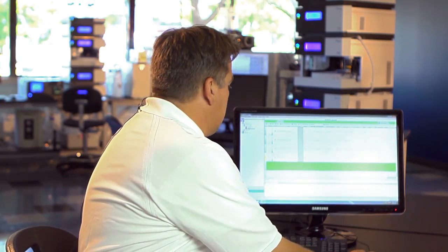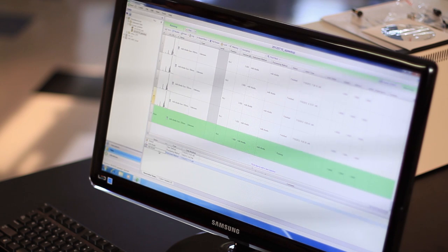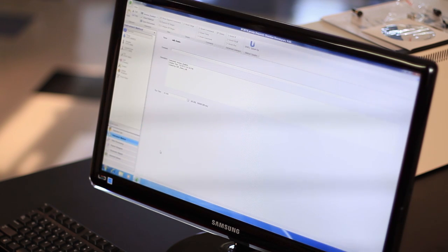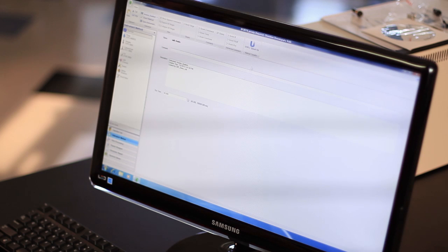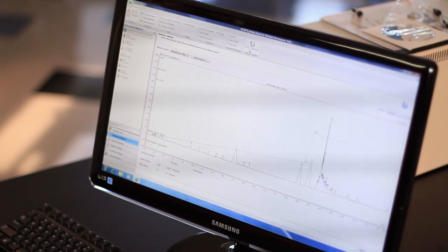I'm here in the Chromeleon console. I open up the existing instrument method I'm using for my LC method — you can see it's even running at this moment — and I have a nice friendly button here for my speedup tool, and I can just activate the wizard.